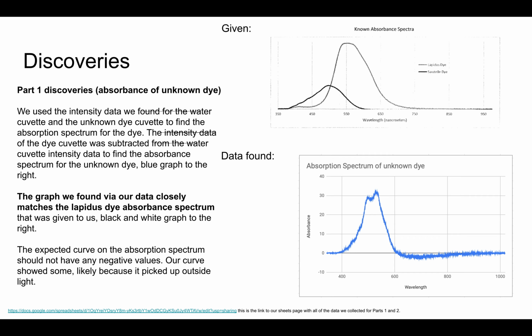The expected curve on the absorption spectra should not have any negative values, and our curve showed some, likely because it picked up outside light.